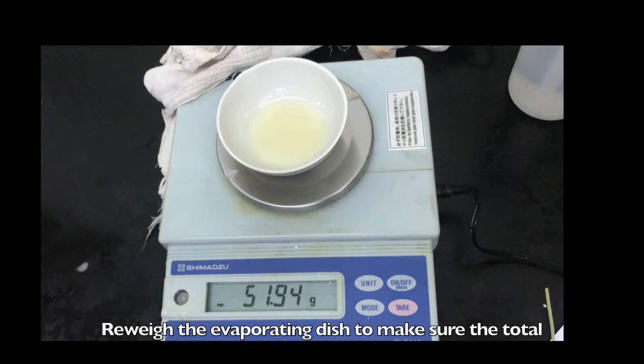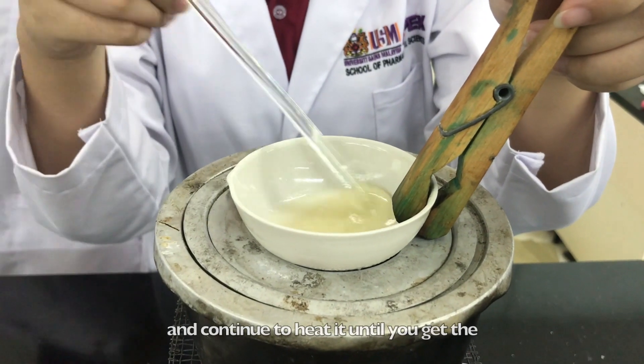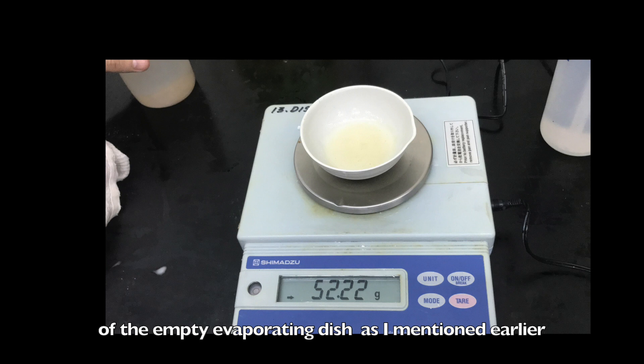Reweigh the evaporating dish to make sure the total weight of the final product. If it's too much, evaporate it. And if it's too little, add more distilled water and continue to heat it until you get the correct weight of the final product. To do that, you will need to know the reading of the empty evaporating dish as mentioned earlier.